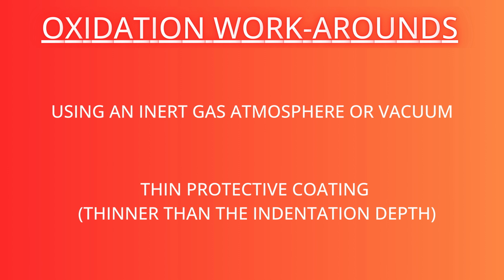But this only works if the coating is thin enough, meaning that the thickness of the coating has to be significantly less than the penetration depth during the indentation.